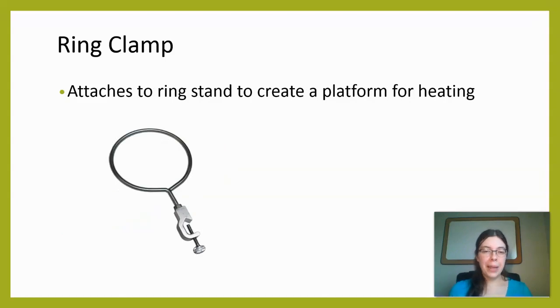We also have ring clamps, which, again, the name is pretty descriptive. It's a big ring that acts as a clamp. So this is going to attach to the ring stand, and it creates a platform for heating. If we're using our crucible and lid or our clay triangle, the ring stand is really common for that.